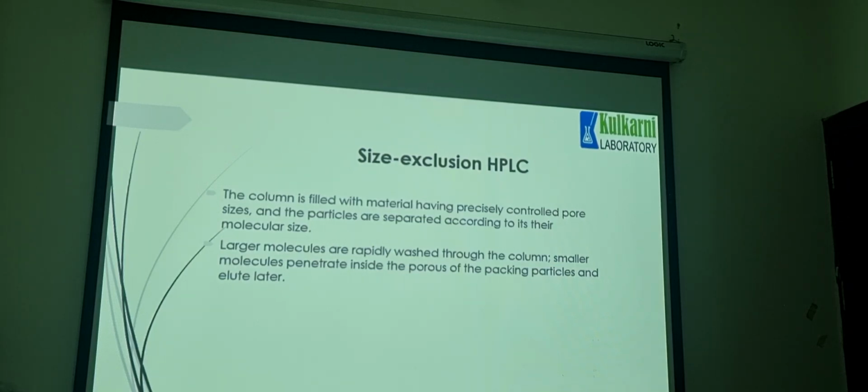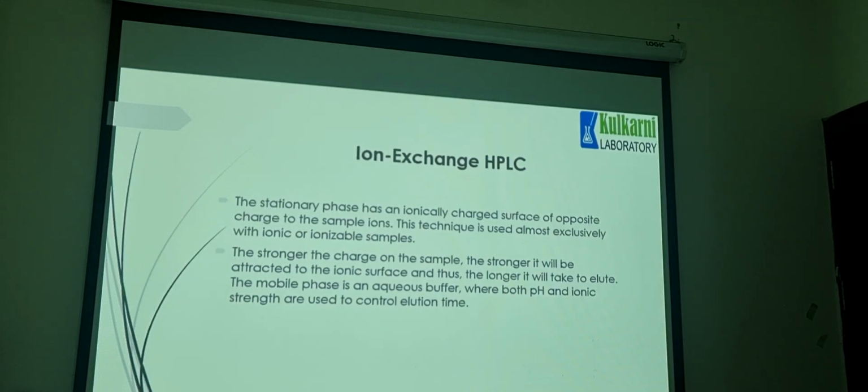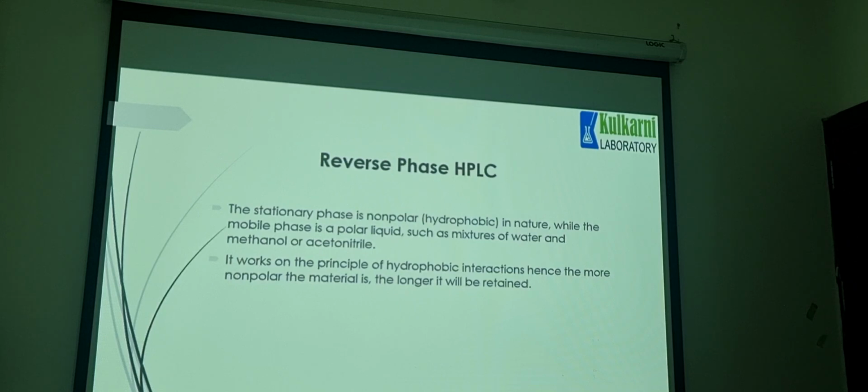Understood? And what about this thing? Ion exchange is based on charges, correct? And these two, reverse phase and normal phase, are based on polarity. So I think you might have understood everything, like types of HPLC techniques. Understood?